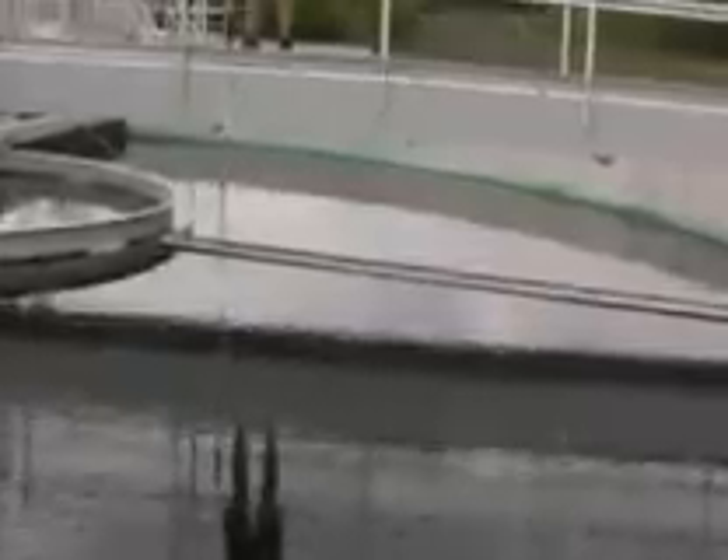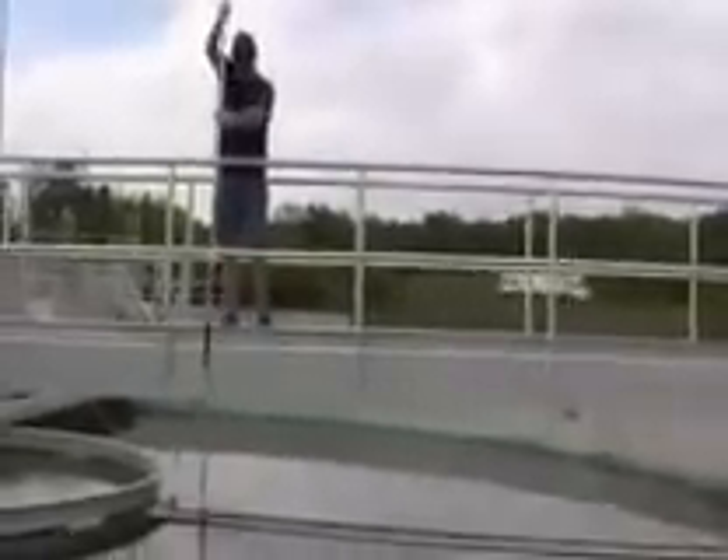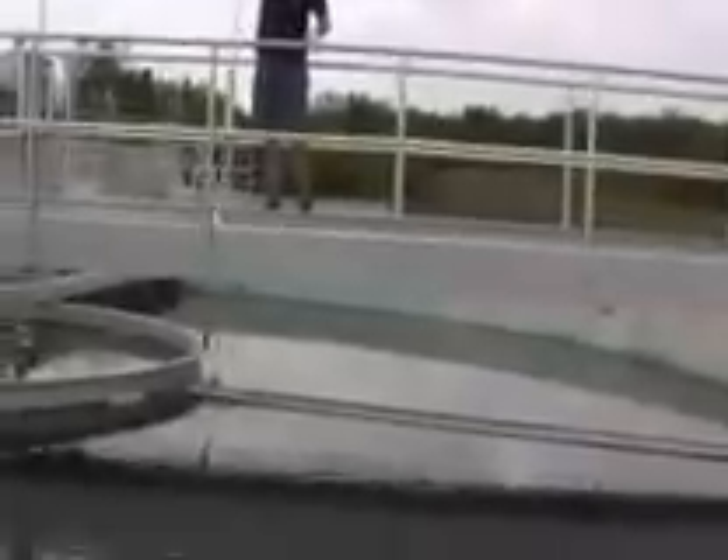Once the tube hits the floor of the clarifier, the foot valve opens, allowing the tube to fill with sludge and water. Count to five and slowly start lifting the sludge judge using the hand over hand method until one is able to read the level of the sludge in the tube.